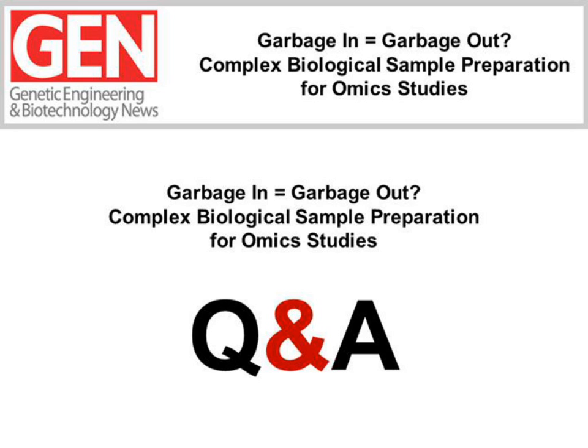Okay, thank you. And another question, Ivona. Bear with me, it's a little long. I'm attempting to run an experiment in which I gain both metabolomic and lipidomic samples. I'm using a chloroform methanol method, which results in a white cell debris layer between the phases. Can I gain proteome analysis from this white layer? Proteome analysis, meaning total amount of proteins, I guess, in the estimation.